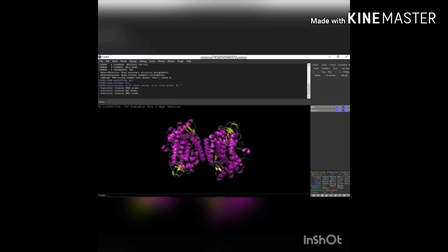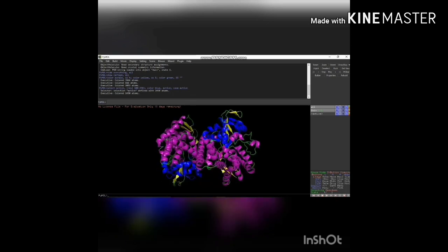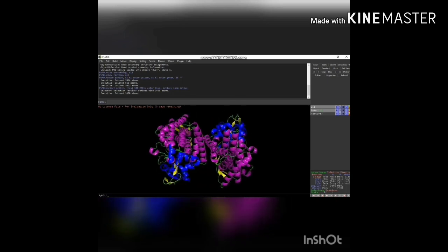Then you can identify your active site, which is involved in enzyme activity. Give the command: select active, (resi 100 to 200) — or you can specify any residue range. You can differentiate the active site using the color blue. Give the command: color blue, active. Then give the command: zoom active. You can view the active site clearly — the blue color indicates the active site involved in the enzyme activity.